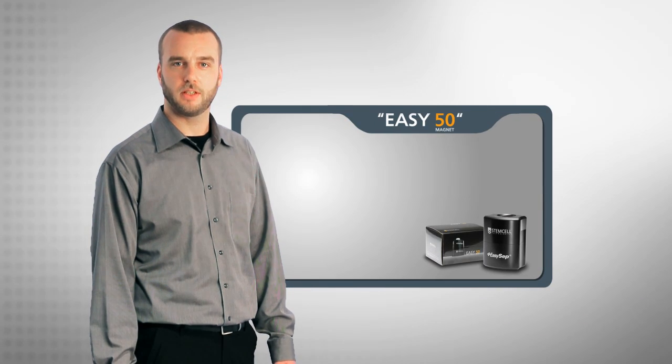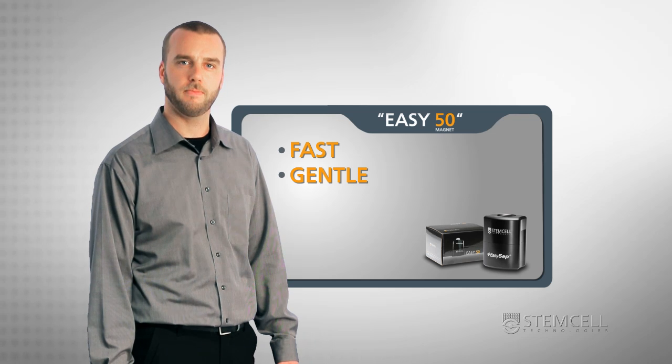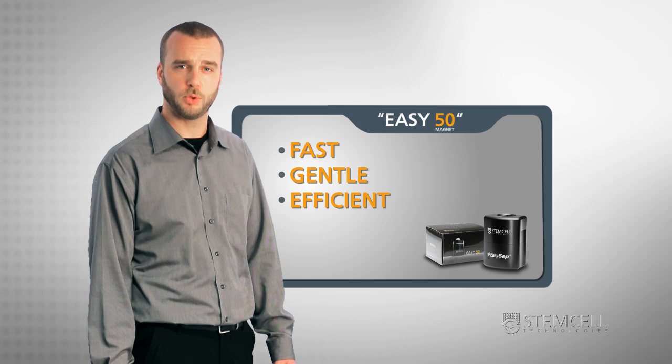Are you isolating cells from large sample volumes? The EZ50 EZ-Set Magnet from StemCell Technologies is a fast and convenient column-free cell isolation system for processing cell volumes up to 40 milliliters or 4 times 10 to the 9 cells in a single separation.